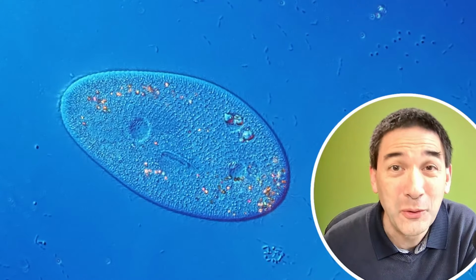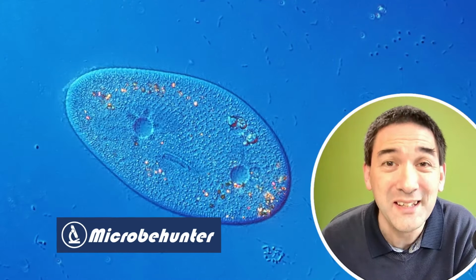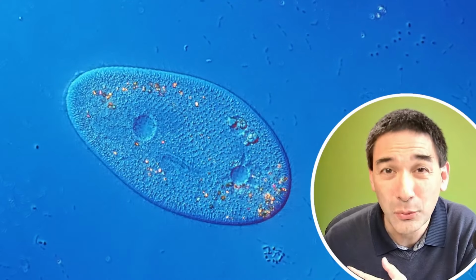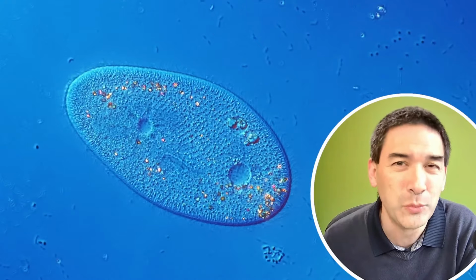Microbehunter here. Well, today we're going to have a very deep look into a cell, into this paramecium here. This paramecium is a single-celled microorganism. It's a protist. And the question I would like to explore today is, why does it not explode? Why does it not pop open? Right? Now you might wonder, why should it?